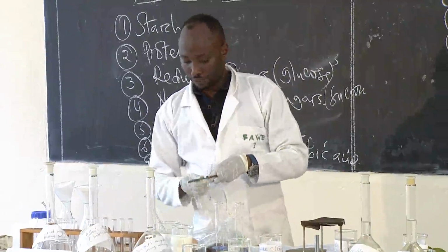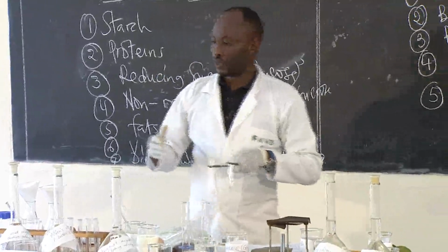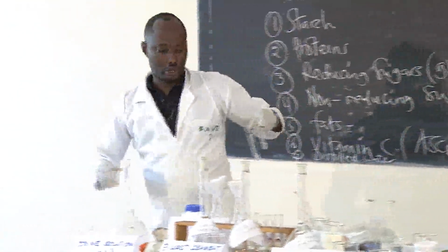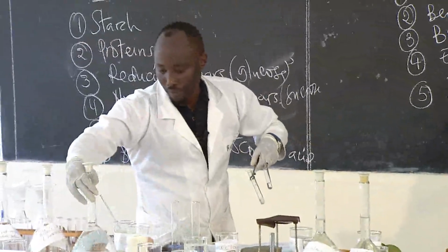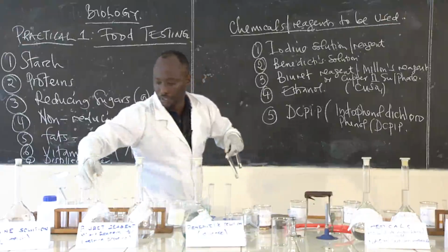The same amount. I'm going to use a solution which is called the Biuret test.